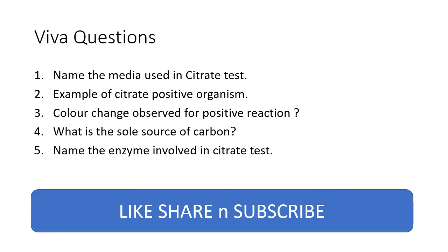Okay, some viva questions on this test. The name of the media used for the citrate test: Simmons citrate agar. Examples of citrate positive and citrate negative organisms, we have already seen that. Color change observed for a positive reaction: green to blue. Blue is at alkaline pH and at neutral pH it is green. Which is the dye? The dye is bromothymol blue. What is the sole source of carbon used here? That is citrate. Then name the enzyme involved in the citrate test: citrate permease.